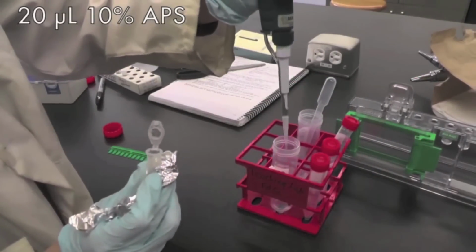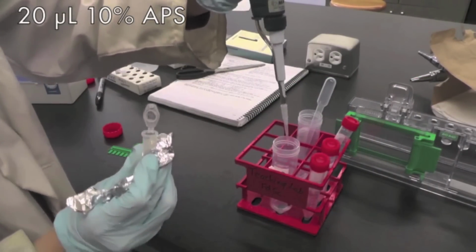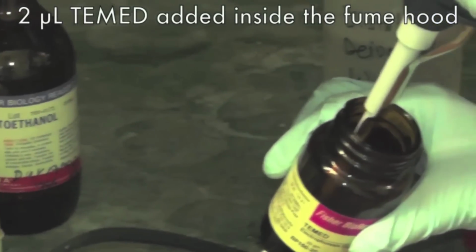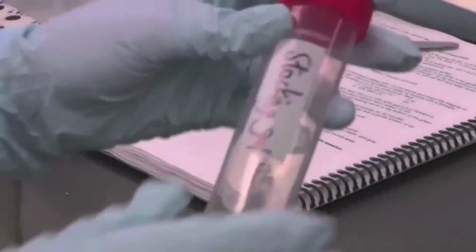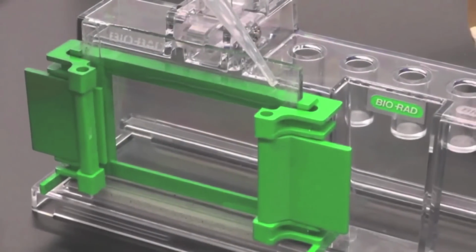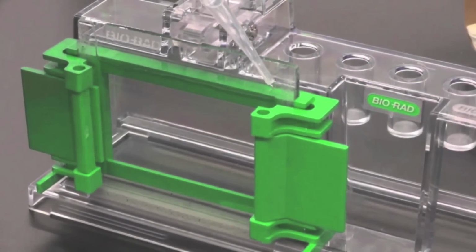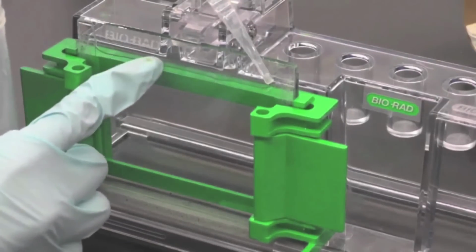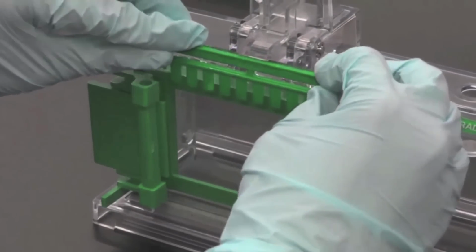Right before you're ready to pour the stacking gel, add 20μL of 10% APS and 2μL of TEMED into the stacking gel solution. Mix well. Immediately pipette about 1mL of stacking gel solution on top of the resolving gel in between the plates. Fill to the top, then insert the comb into the solution. Wait for the gel to polymerize.